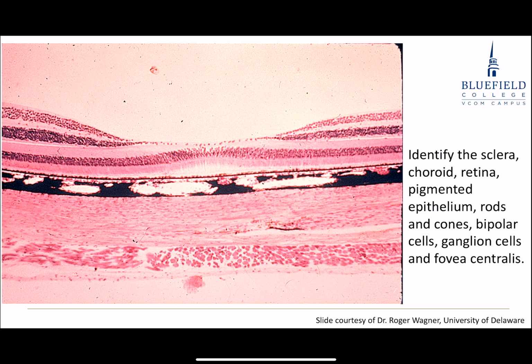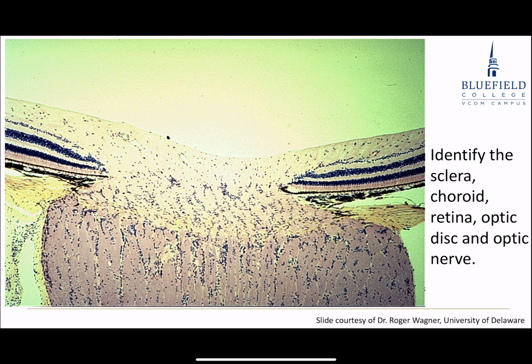Here I've got a very thick layer of all those axons of ganglion cells filling up. It's going to take a downward turn right here, become the optic nerve, and you can see from where it goes from a yellowish white to more of a pinkish color, that's where you begin to myelinate those axons. I promise you, if I had this put on the exam, I'll give you the opportunity to misidentify this as a fovea centralis. Okay? And so be able to distinguish between that and that.